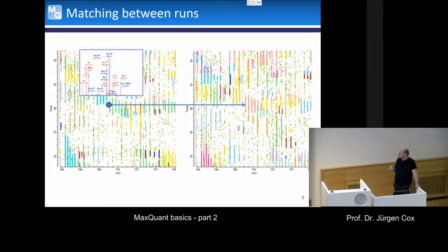So when using similar samples, that works very well. One should not use it on two different samples, for example matching cellular proteomes to plasma proteome or something like this. This will for sure go wrong, as you will just produce too many false positives. But if samples are comparable, this is a well-controlled way of increasing your quantifiable features in your sample.